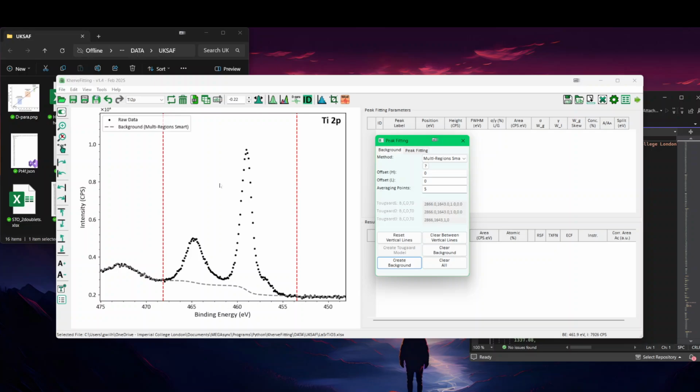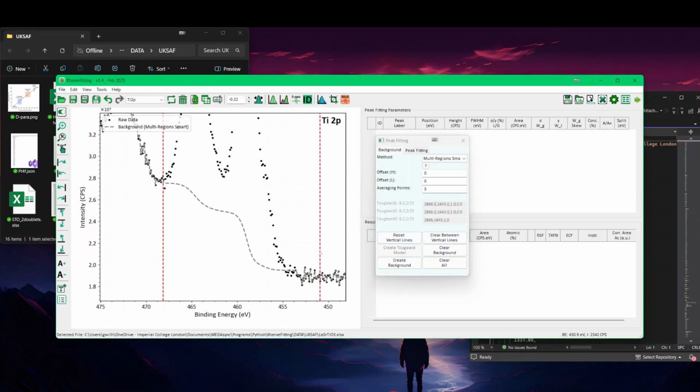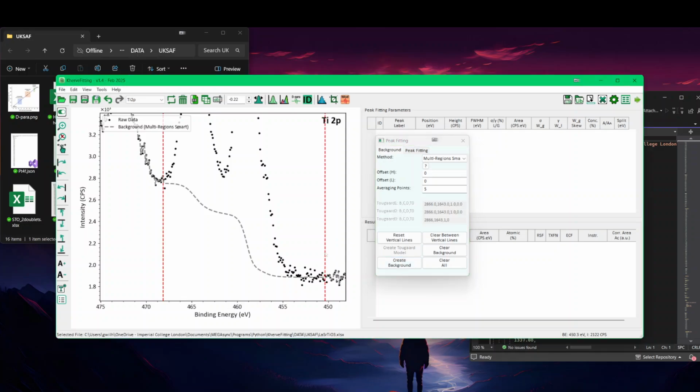And then we can zoom in with the control down. You may be happy with what you have. You may want to redo it, and you can redo it again by even just moving that slightly and just recalculate it. But if you want to change the offset, you can see what I just did here.